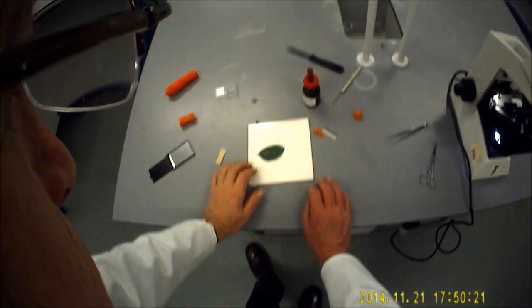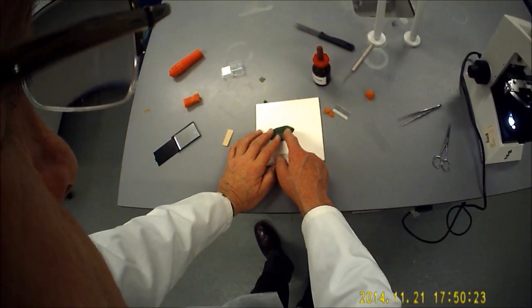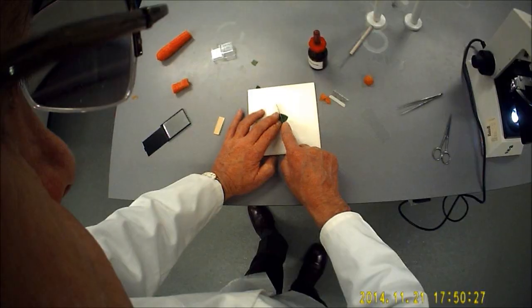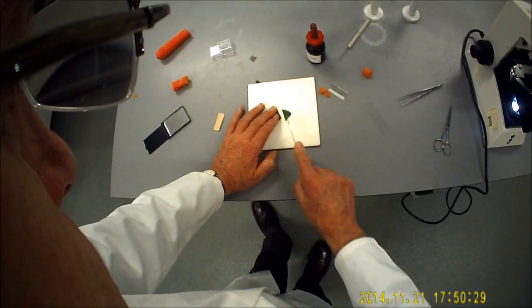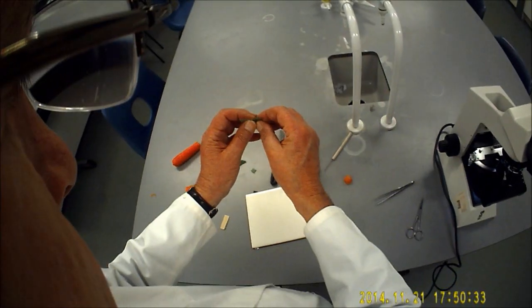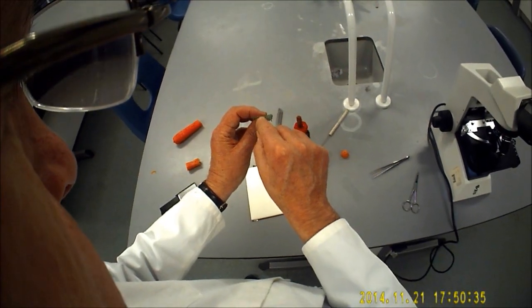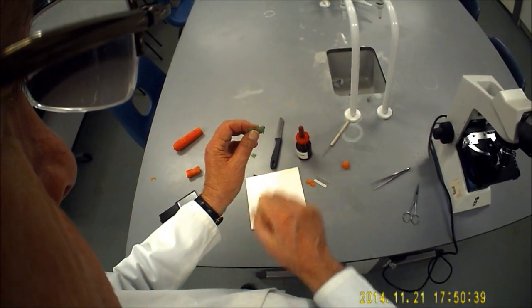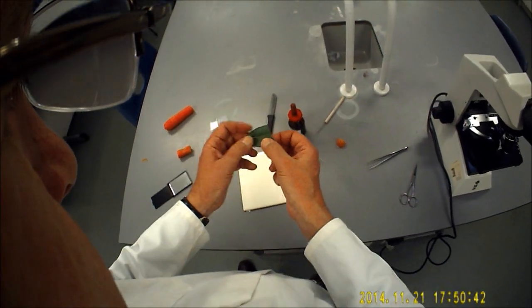So what we're going to do today is prepare a thin specimen of this leaf so that we can look at it end-on. What we want to do is to be able to examine through the microscope that aspect of the leaf and we want to see the different layers of the cells there.